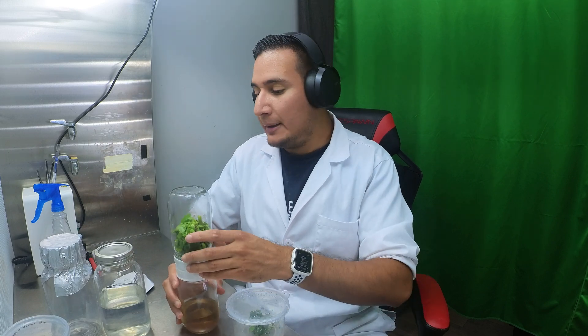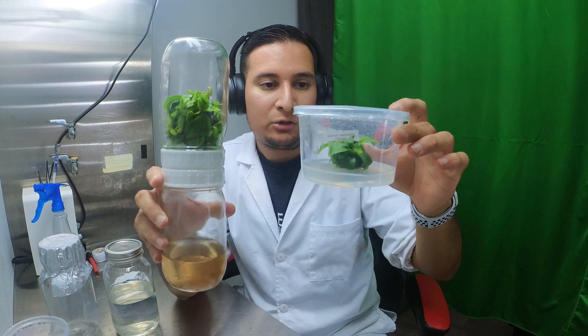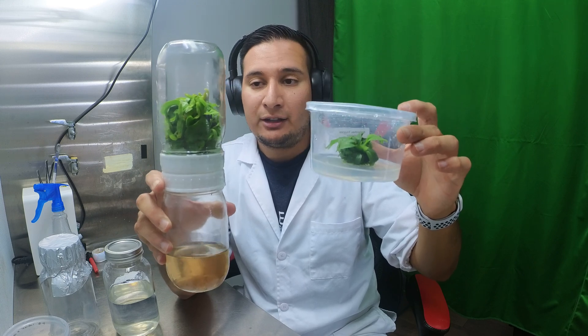Today I'm moving the Nepenthes truncata to new media in bigger 32-ounce jars. As a comparison, here is the Nepenthes truncata in the biocoupler and here is the traditional tissue culture in a 16-ounce deli container. They were germinated at the same time and moved at the same time.